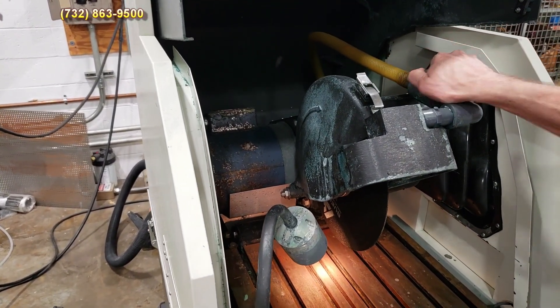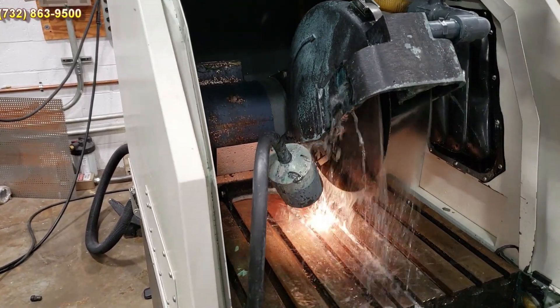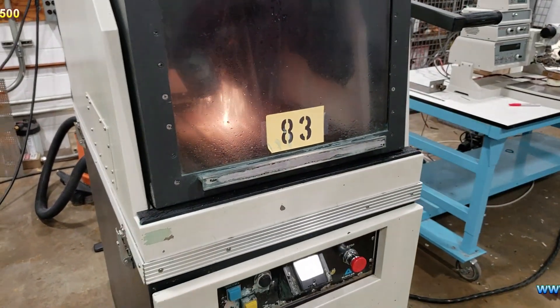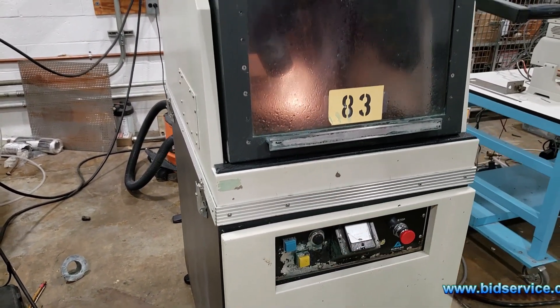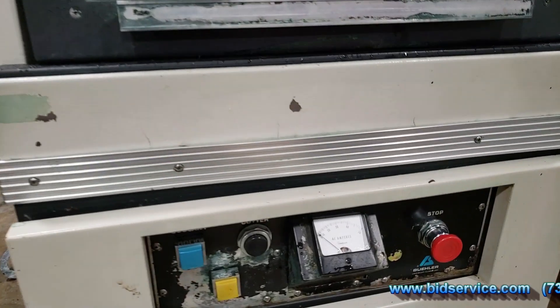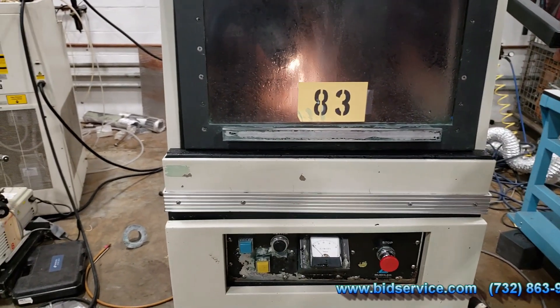Let's open up the blade coolant, then go ahead and close that off, and turn on the motor for the blade — go ahead and hit the black button here. You have a current meter here, and then you can bring the blade down.